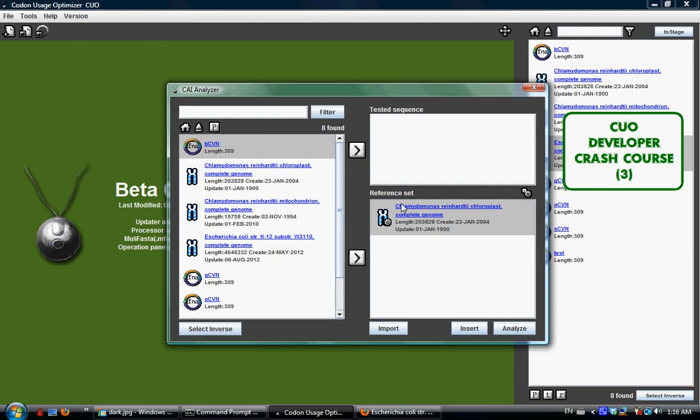So, there are three different ways of analyzing a host genome. The first one is this one, the genome icon with a wheel beside it, which is an auto pick analysis. The second one, if you double click the genome, is that the wheel is gone, and this is the complete genome analysis. And for the third kind, I just delete this. I press the delete key on the keyboard and delete the fragment.